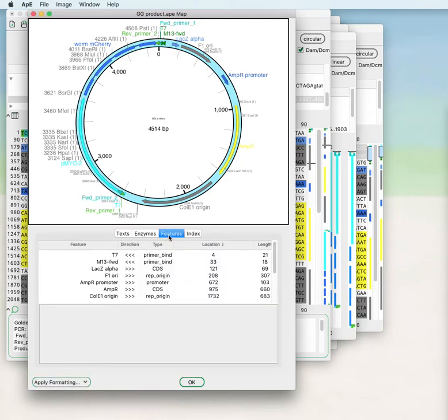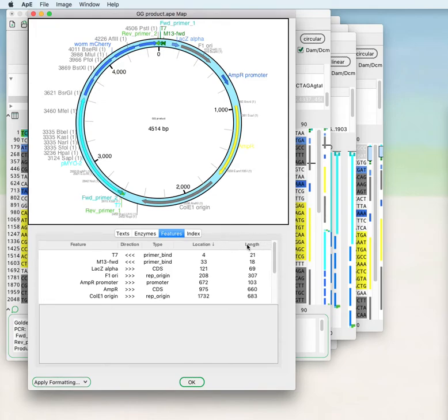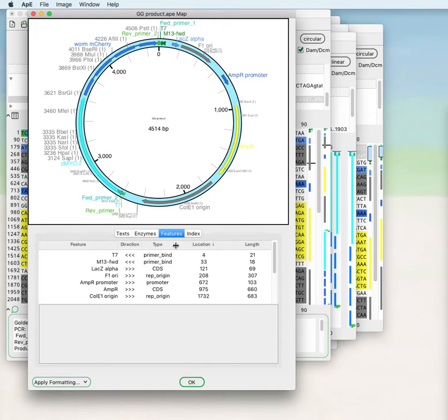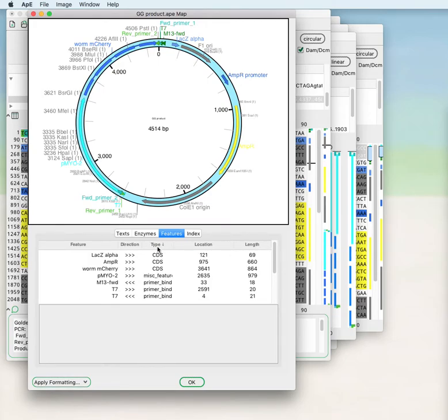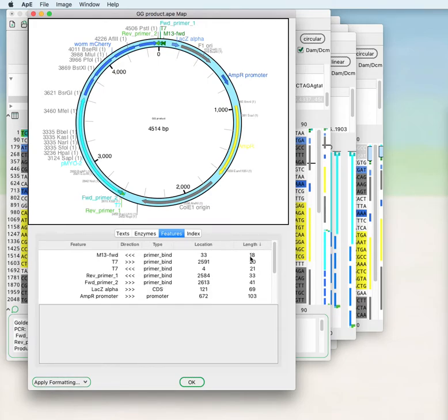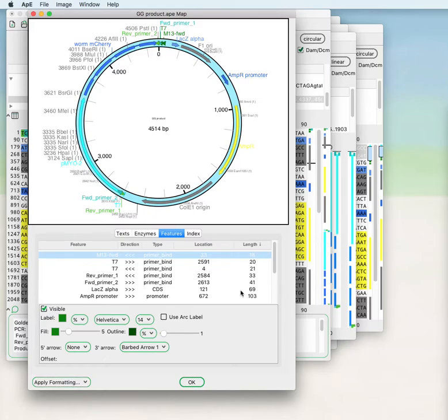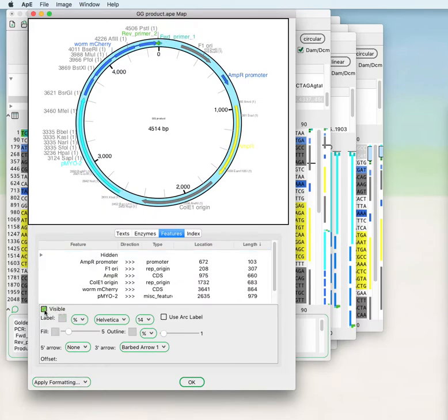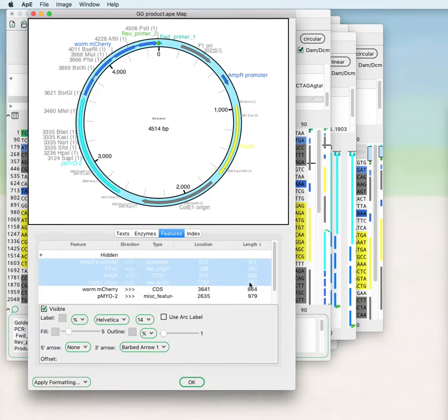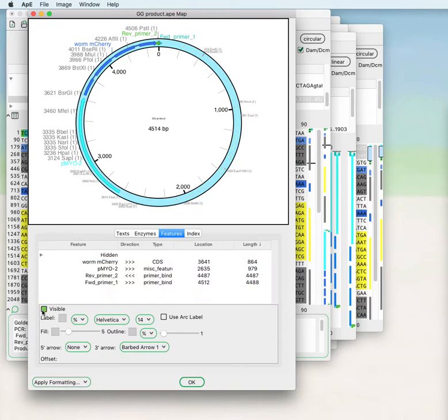Within features you can do several things. You can sort this table of features by their location, by their length, by their type. You can take any selected features and hide them from the map, so that only the features that you're particularly interested in at the time are visible.